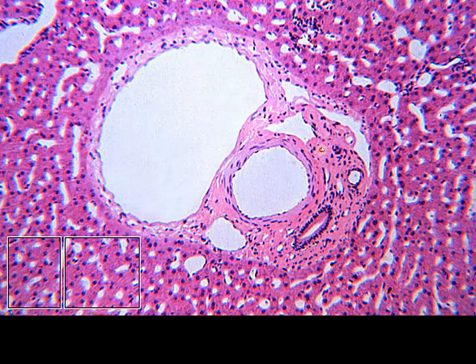Now, it looks like we have some other vessels in here as well. These very small ones that we see, just endothelium, fairly large lumen. These are going to be lymphatic vessels. And you may or may not have more than one of each representative in this area of the hepatic triad. But the triad really is for the venous supply, arterial supply, and the biliary supply.